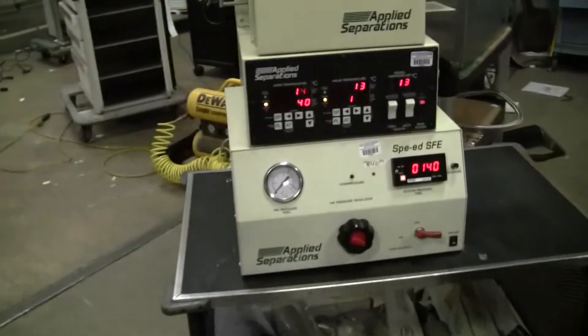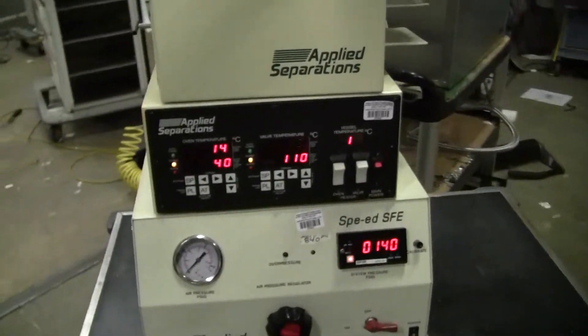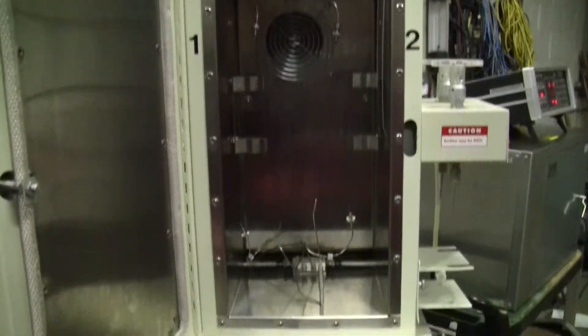We have the unit powered up. It does not look like it has its vessels — you have to purchase them from the company. They are available in Allentown, Pennsylvania.